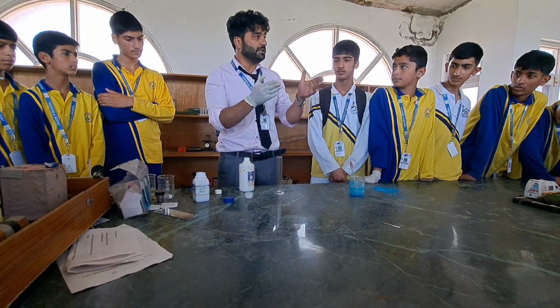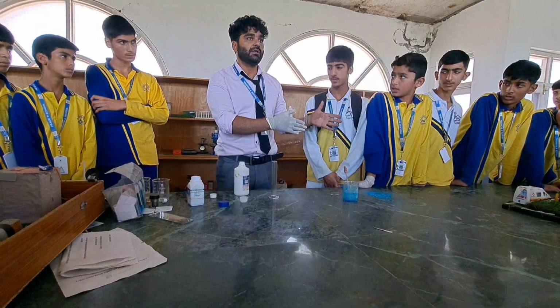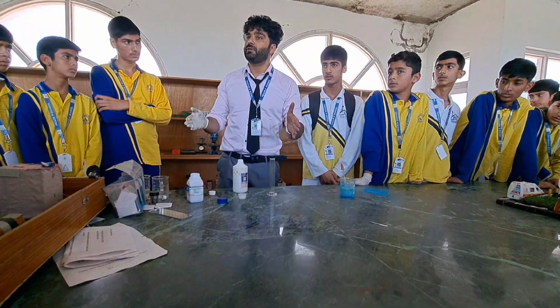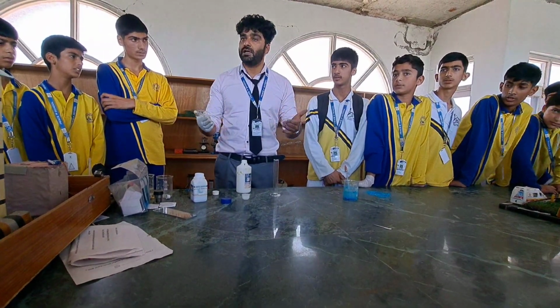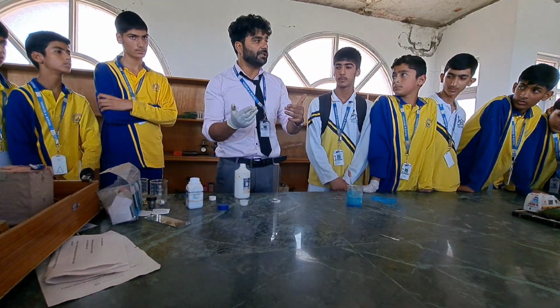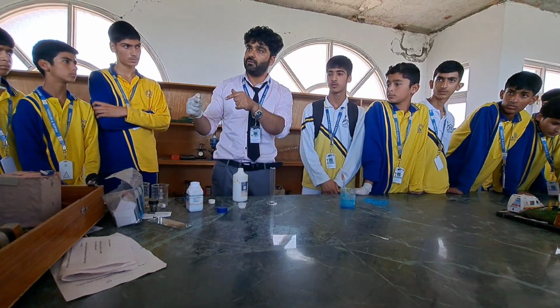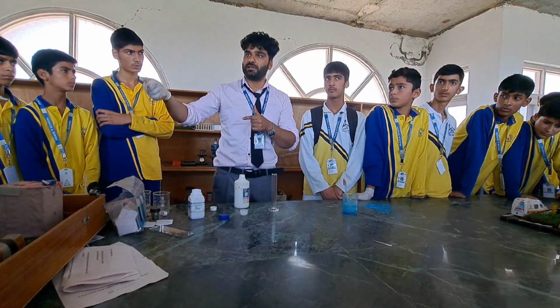Yes, sir. In this reaction, a lot of heat is evolved. Is this an exothermic reaction? Yes, sir. What are exothermic reactions? In which heat is released. And can I ask you one more question? Yes, sir. How do we show the heat is produced in exothermic reactions? We usually write down plus heat on the product side.